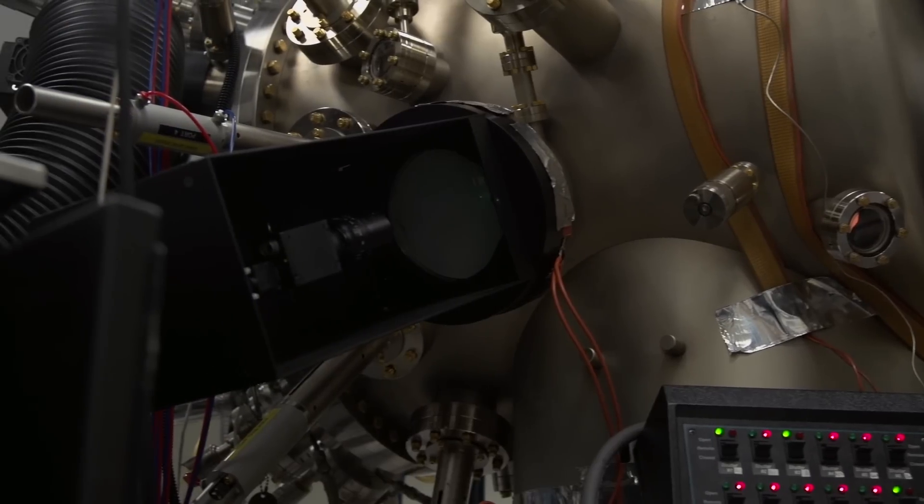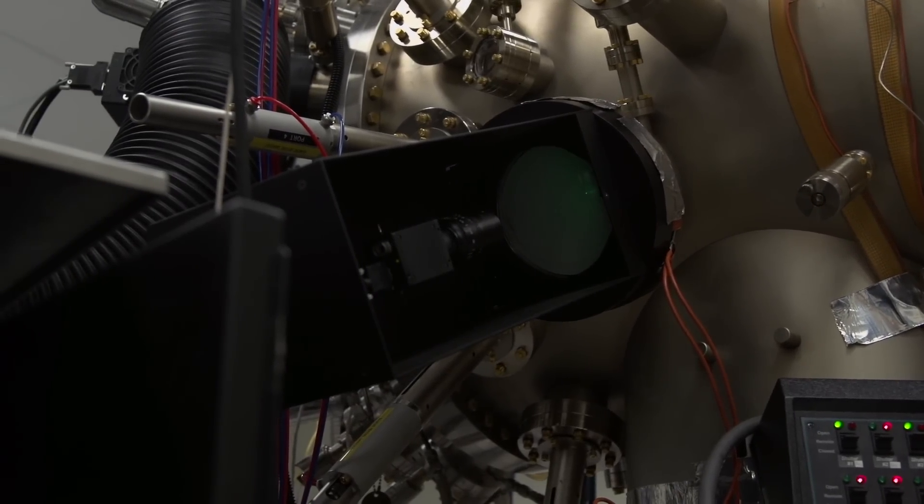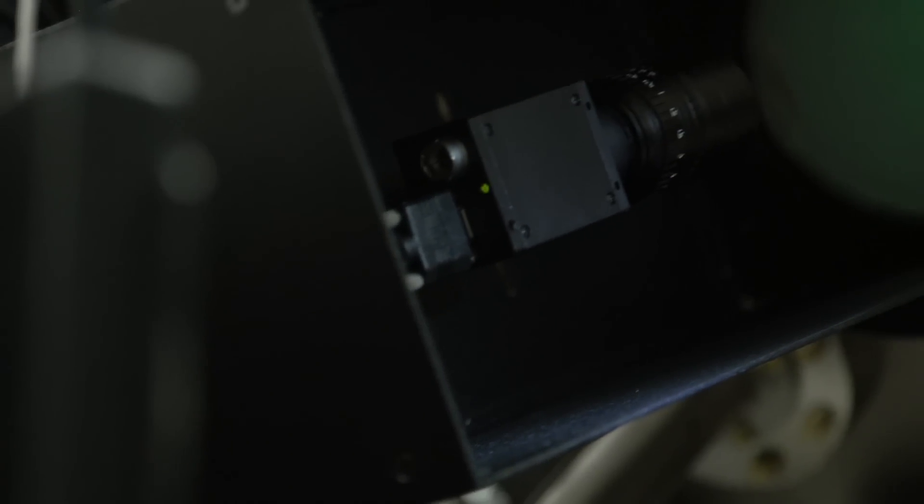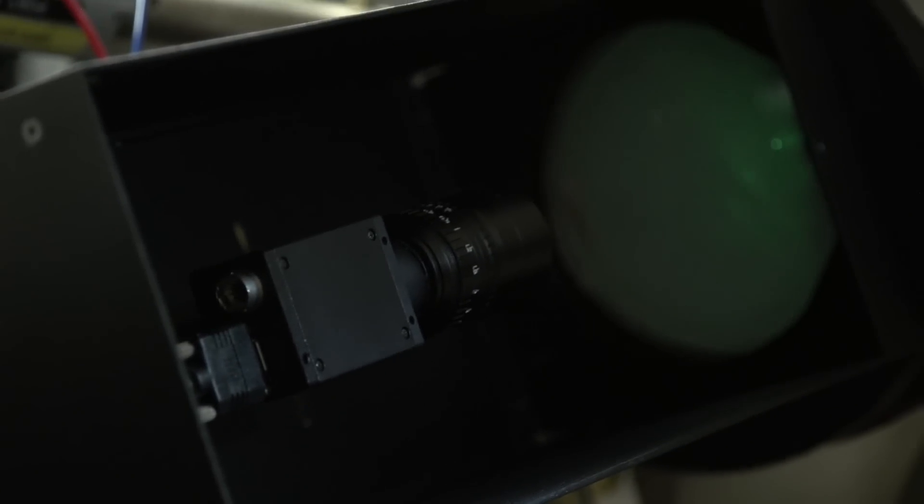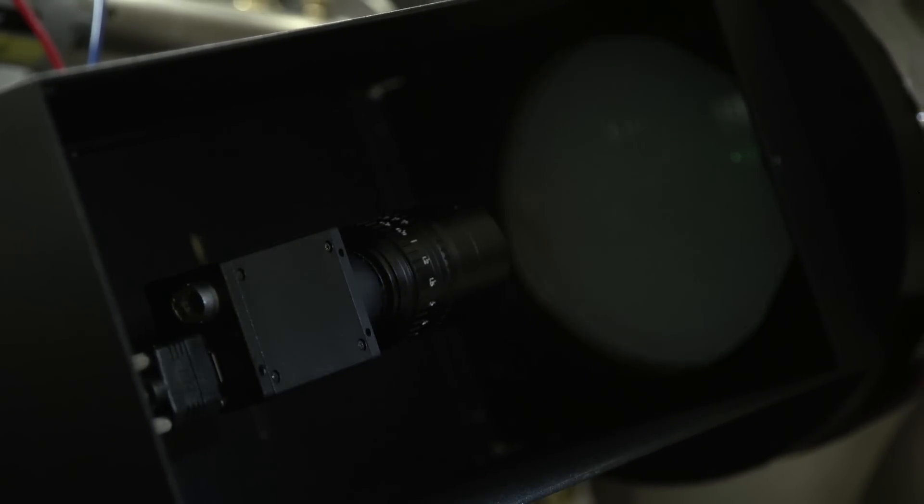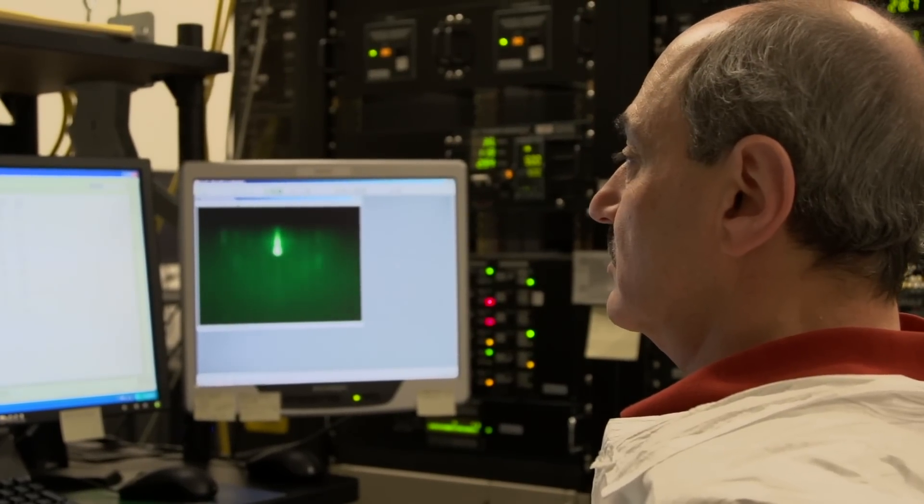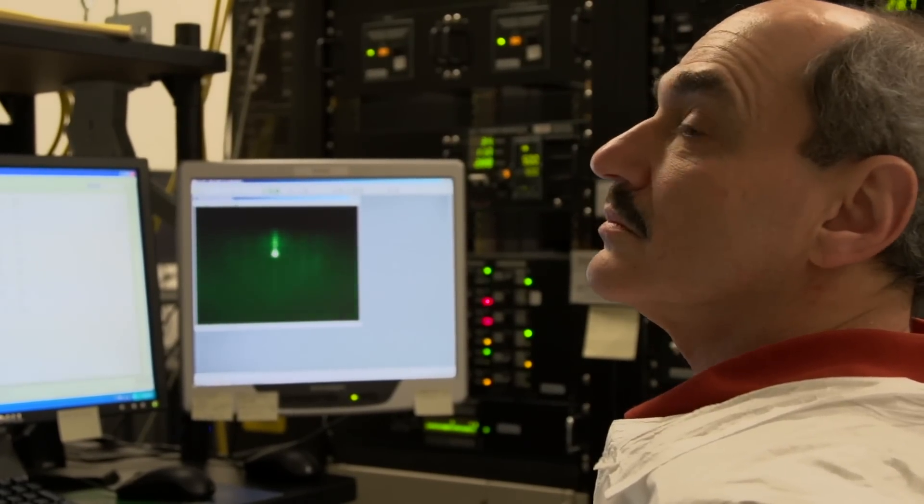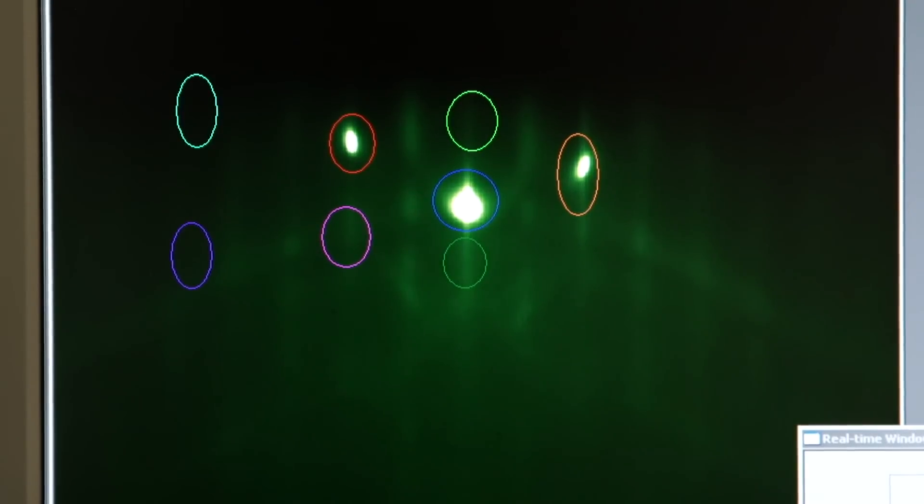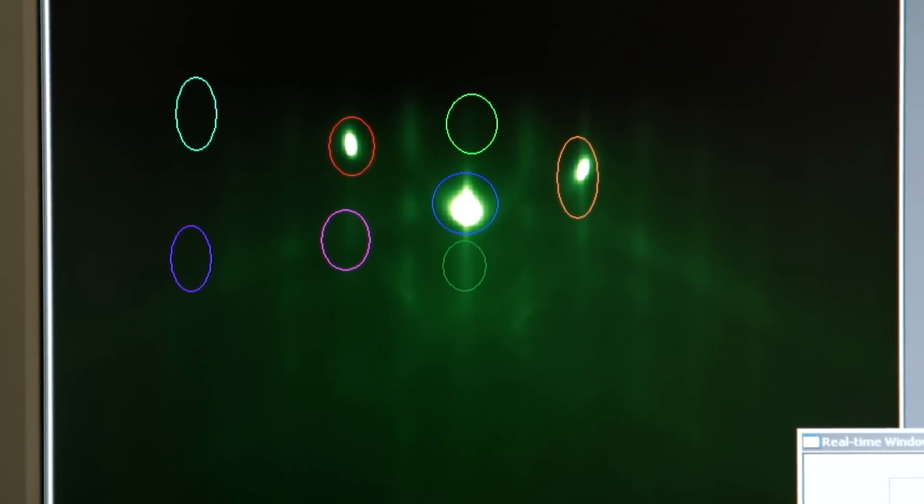I have to be able to nail the thickness and the composition dead on. And that's where something like the KSA 400 really helps me out in terms of establishing growth rates and compositions very accurately. Inside of a minute, boom, I've got not only a single point worth of data, I've got multiple points of data, and I can average them out to get really, really accurate deposition rates.